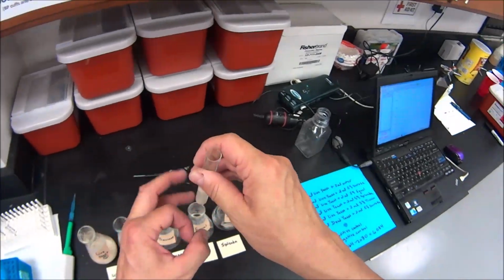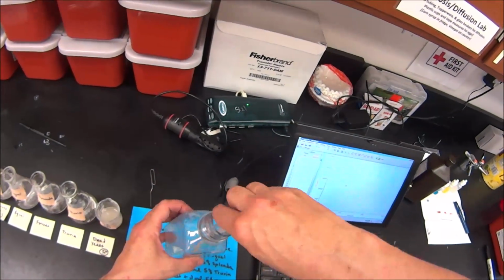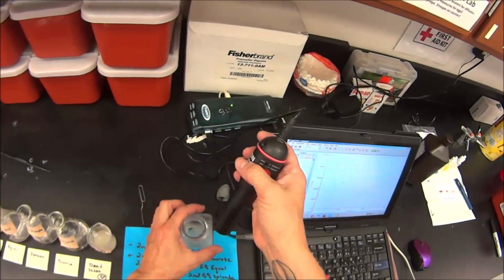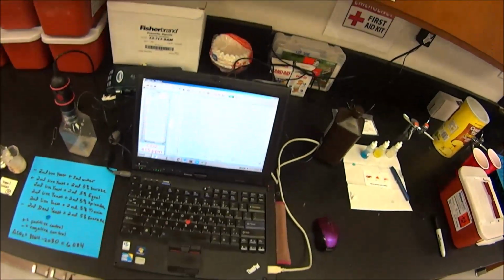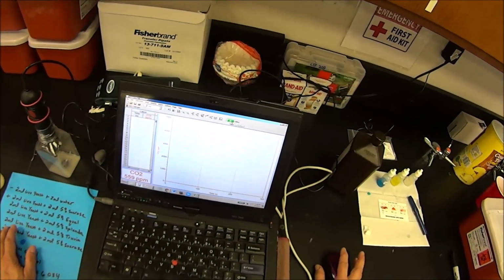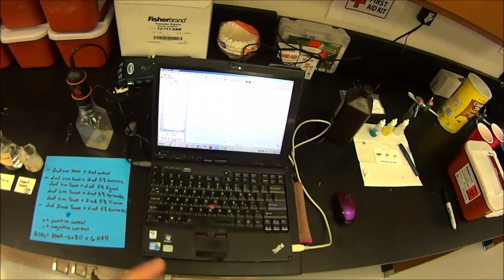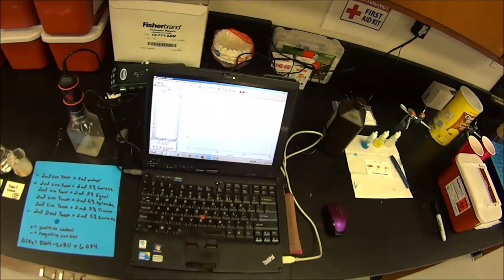Okay, this has come out of the incubator after 5 minutes, and I'm going to put it into the respiration chamber, pour it all in. Okay, and now I'm going to use a CO2 probe to measure the CO2 produced. So I'm going to put that on, and here is our Logger Pro program that is going to measure CO2. So I'm going to hit collect. And what will happen is every 30 seconds, that probe is going to measure CO2. There's our first reading. And so we're going to come back in just a minute and see what has happened with our CO2 production over 5 minutes.